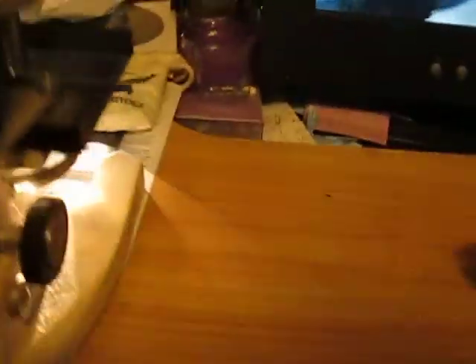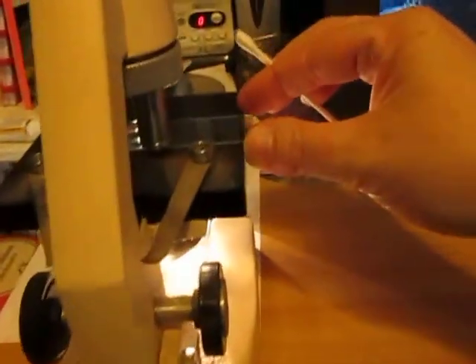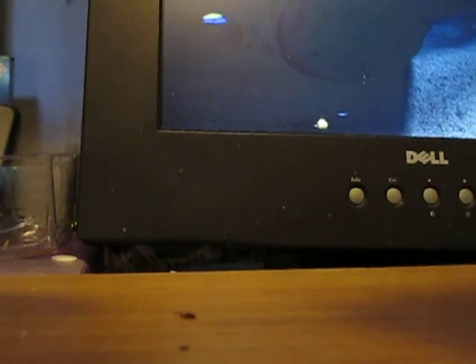Wow. So I have a slide here, and I had already taken off a couple of scales. The thing that I'm worried about is that it's not actually ich, which means my treatment is pointless. So I'm going to make a couple of swabs of what was on here and look at it under the microscope.